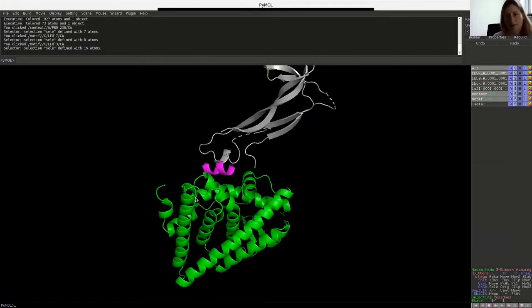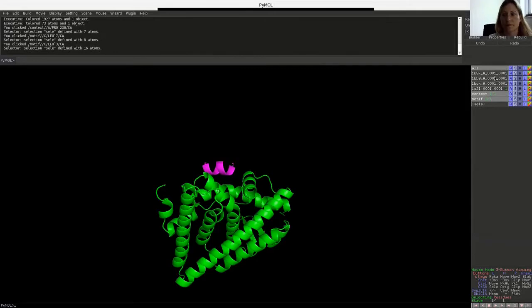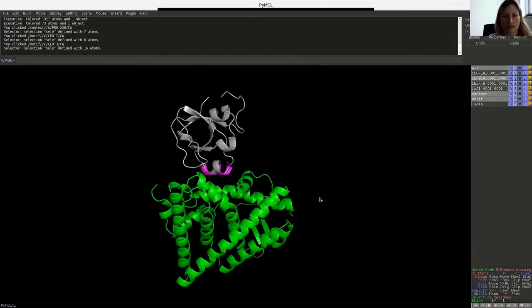Something that happened here is probably it was grafted because it found something in matching backbone. But when it post-processed it, the interface blew up and the proteins were basically more happy to be separated than they were happy to be together, which is always a bad sign for the graft. It means that something is relatively fundamentally wrong. And I could just imagine that there's a big clash or something that moves them apart. So this is probably something you don't want to move forward. So let's check out this one.